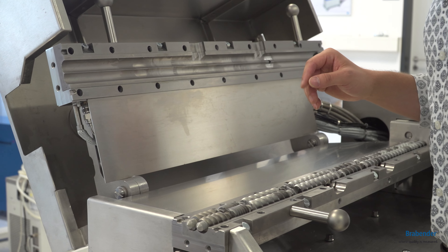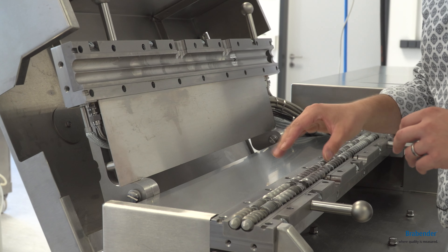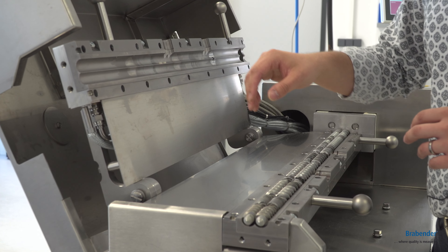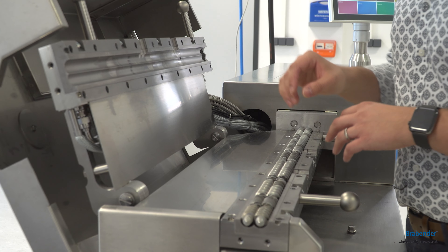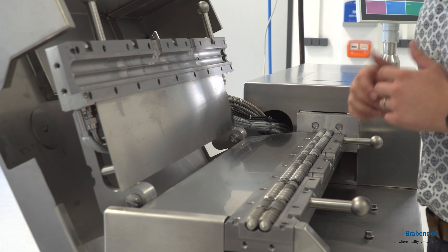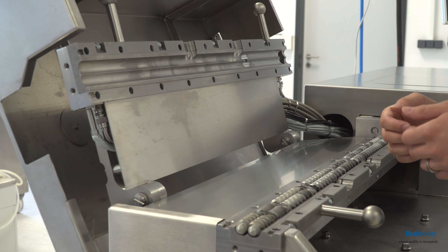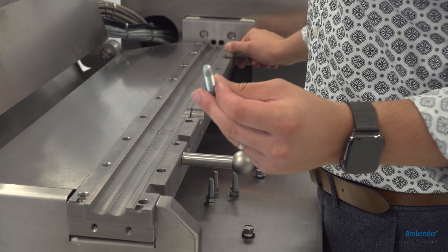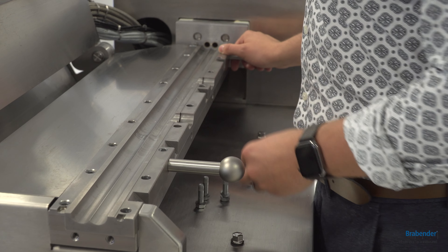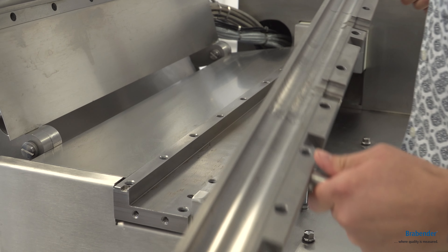Another advantage of our system is that the whole process is temperatured from both sides, which means that the heating will not be only from the top or from the bottom but from both sides. This gives you a much better temperature distribution and temperature behavior during your process. As I said, just remove these small screws — four times — and then you have the possibility to detach the whole liner.